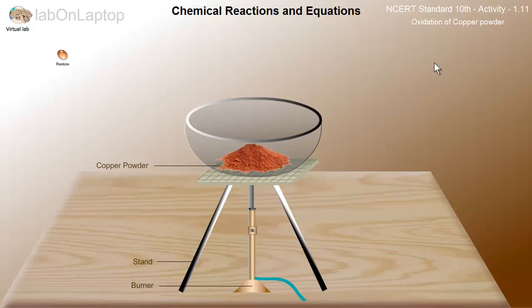So in this experiment, we are going to see how oxidation happens in copper powder. This chapter is the name of Chemical Reactions and Equations. So here you have a tripod, a bowl, we have kept copper powder and a burner.